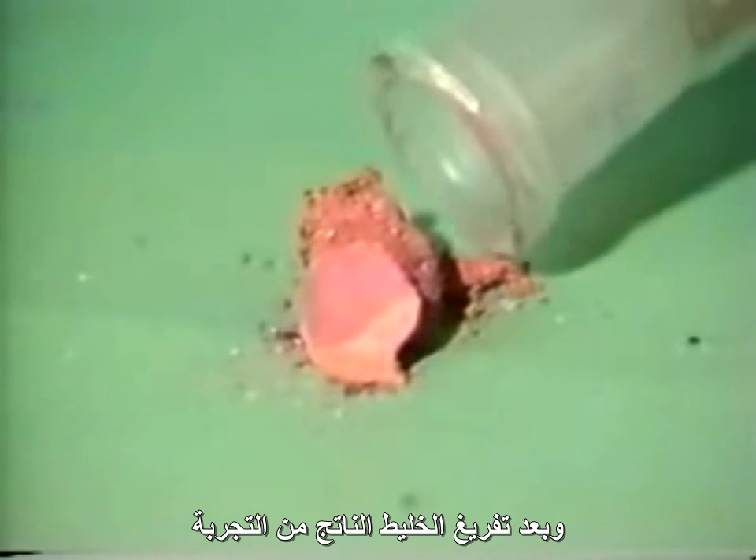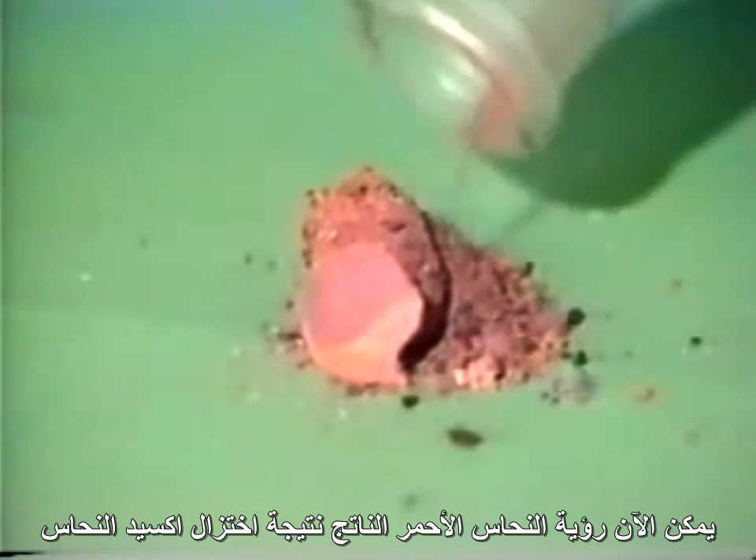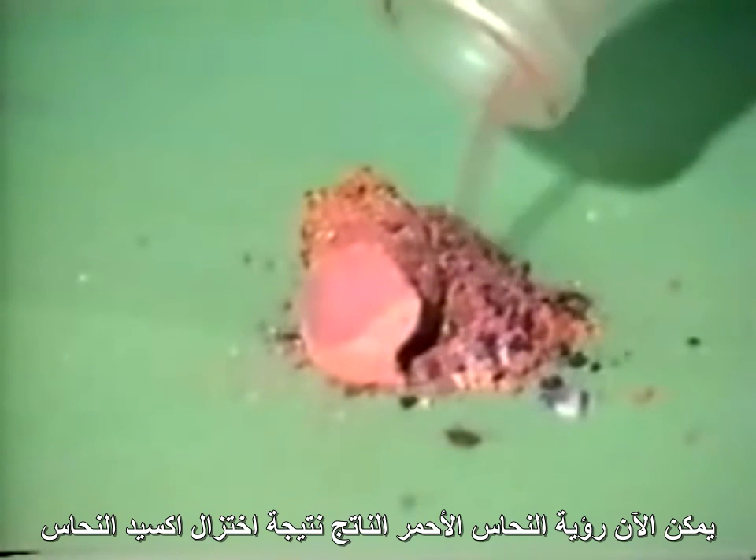After the tube has cooled, we can see the copper that has been formed at the bottom of the tube. When we tip out the mixture at the conclusion of the experiment, we can see that it is now red-brown due to the copper produced by the reduction of copper oxide.